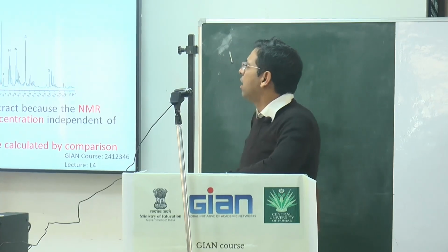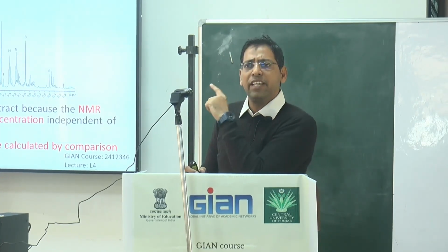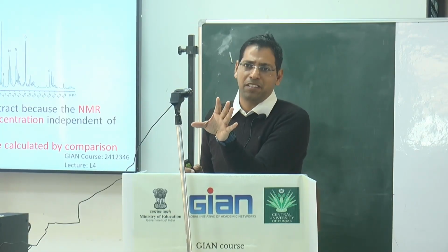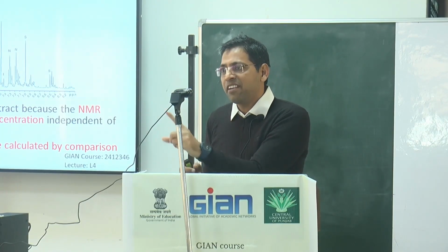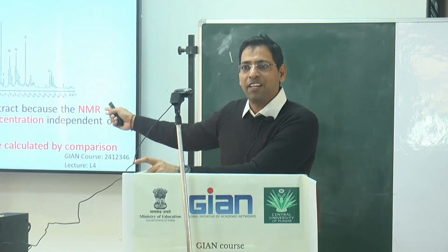And remember, you can easily get the NMR within 30 minutes. So one day for the sample preparation, and the next day you can go ahead with the 1H NMR.